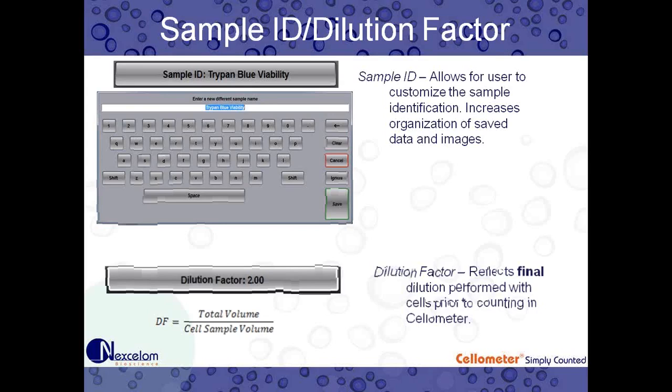So next, there's also the auto-saving feature found in settings on the home screen. When it's turned on, it allows the user to save to a specific folder and to generate data reports. This ensures that your samples are saved to the right place every time, and it allows the user to quickly go through a series of samples.